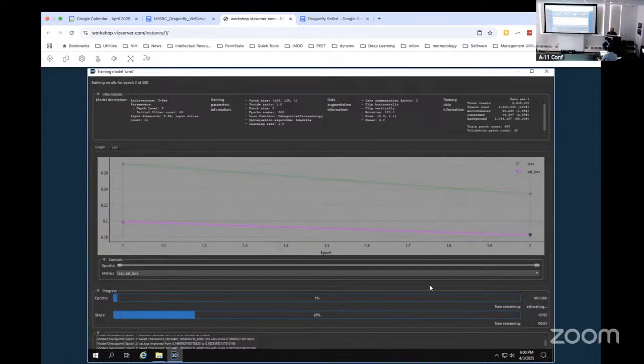What was the input output you're supposed to select? Okay. Yeah. I could now go to. Okay, yeah, right, and, online, I look online.